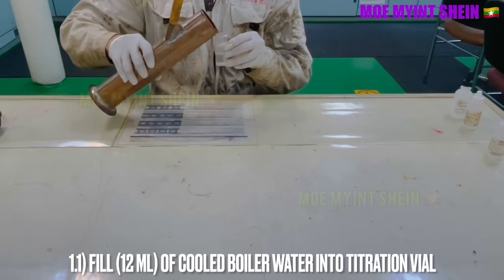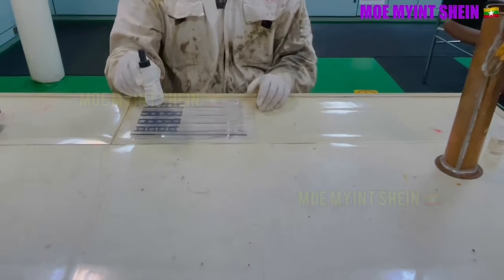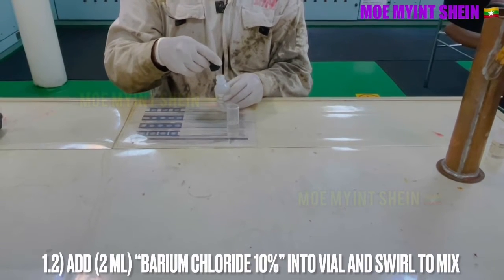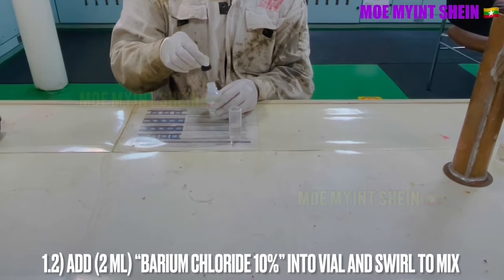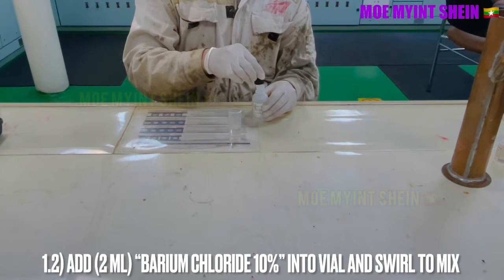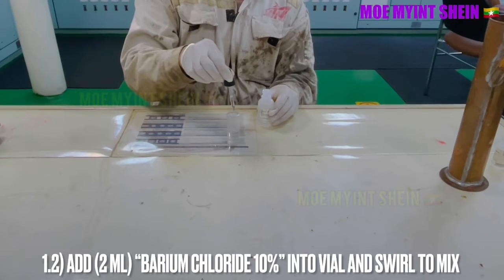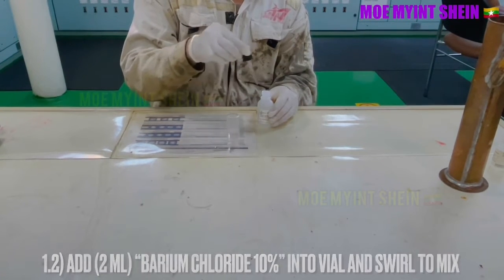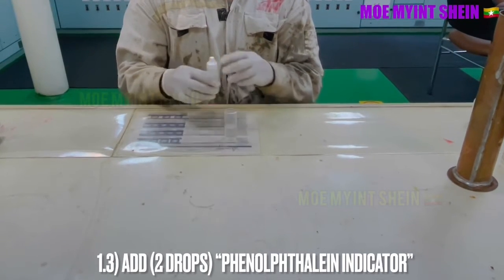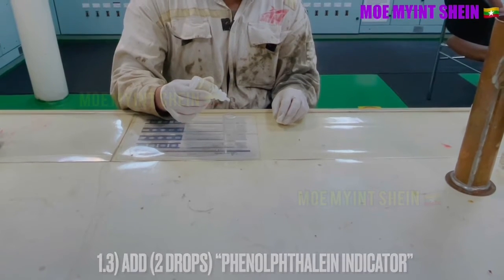Fill 12 milliliters of sample water into the titration vial. Then add 2 milliliters of barium chloride 10% into the vial and swirl to mix. Next, add 2 drops of phenolphthalein indicator into the vial.